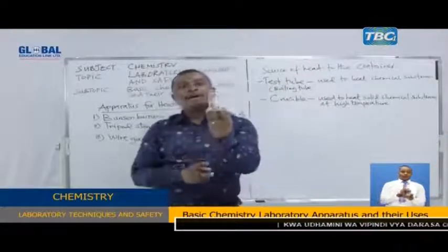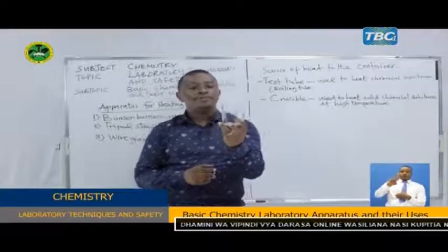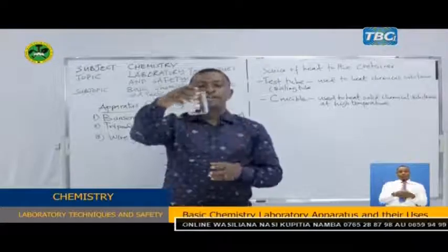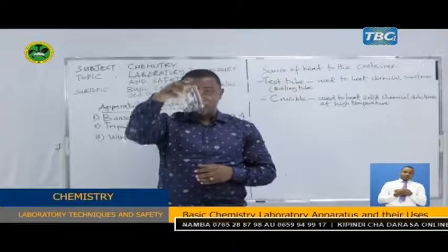This is a beaker. It can also be used for heating different chemicals within the laboratory. The beaker is transparent, you can see it. It is also used for heating.